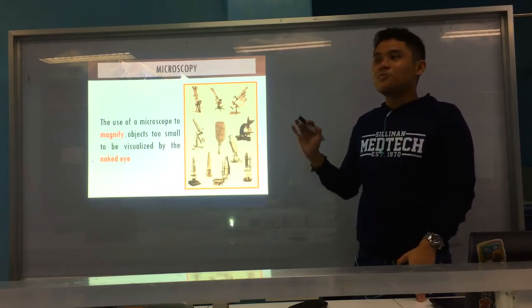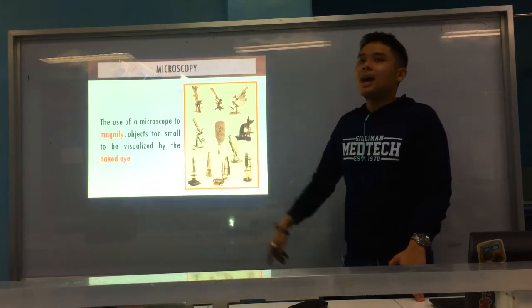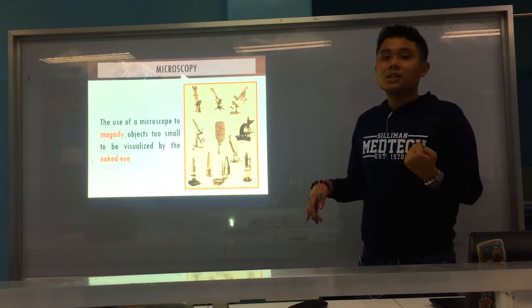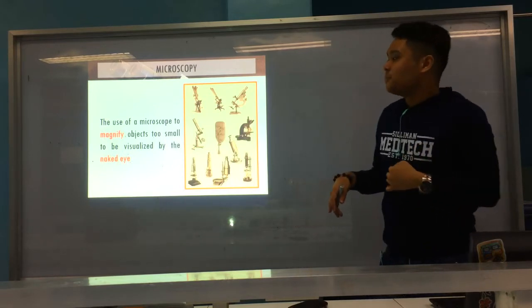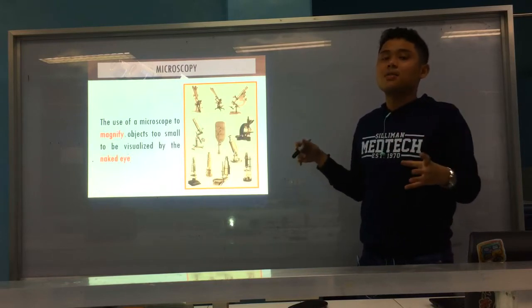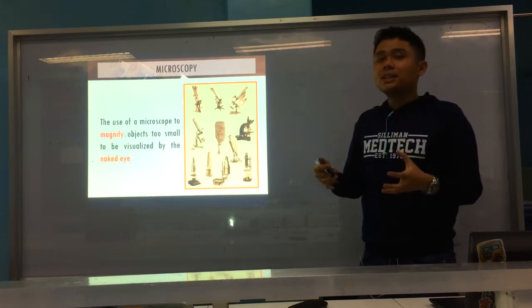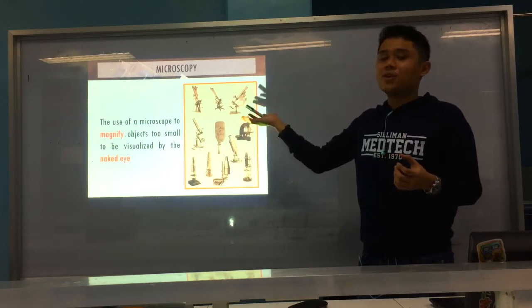The father of microbiology, Antoine van Leeuwenhoek, used his own microscope. And the scientist who discovered cells by examining cork under the microscope was Robert Hooke. The information on size, shape, structures, composition, and cell arrangement can be seen under the microscope. So our main purpose of staining is to enhance observation, because we cannot see them with the naked eye, so we need the aid of a microscope.